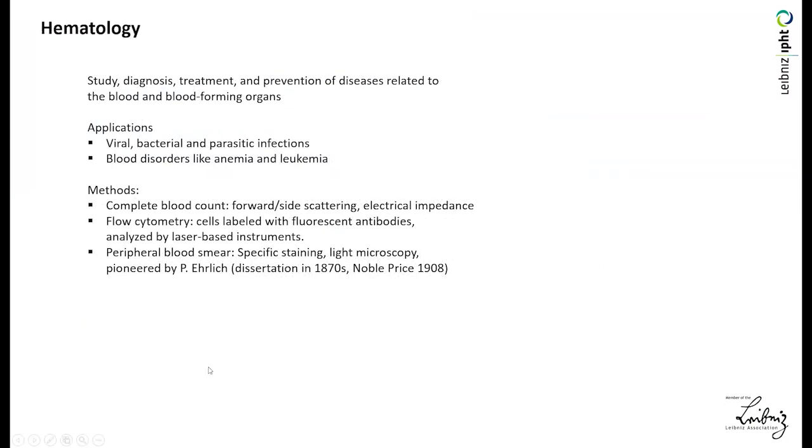Hematology is a branch of medicine concerned with the study, diagnosis, treatment, and prevention of diseases related to the blood and blood-forming organs. Applications include the diagnosis of infections due to viruses, bacteria, and parasites such as malaria. Another application is to investigate blood disorders like anemia and leukemia.